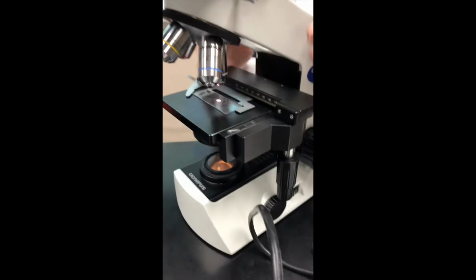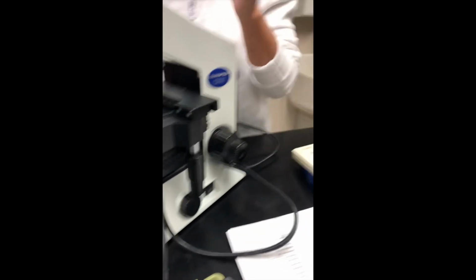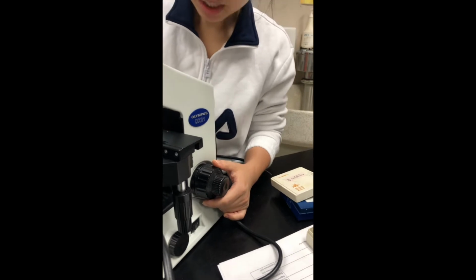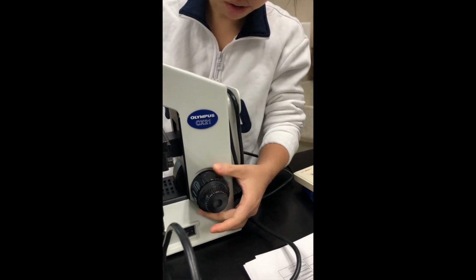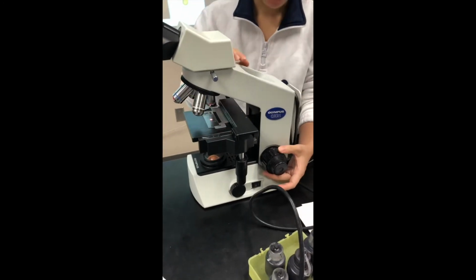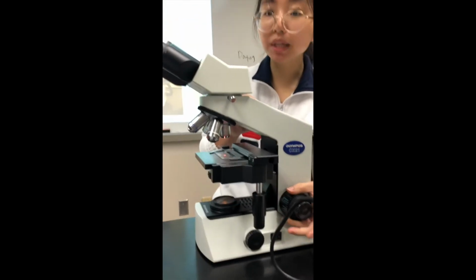We are going to have a look at how to adjust to the best position for you to view our slide by using the coarse focus knob. You could adjust the distance between our objective lens and our slide or our sample. So by adjusting the coarse focus, this one, the big one.